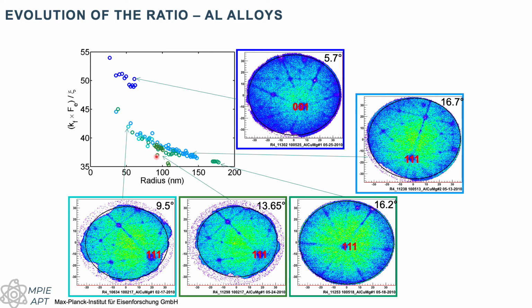You see here it's about 10 to 15, but here you only have a few degrees difference between the analysis conditions. But the orientation of the specimens is quite different. Here we have all one sample, here it's all one sample. So there's probably a role played by the overall geometry of the needle on the value of the KF and the ICF, and the ratio of these values.